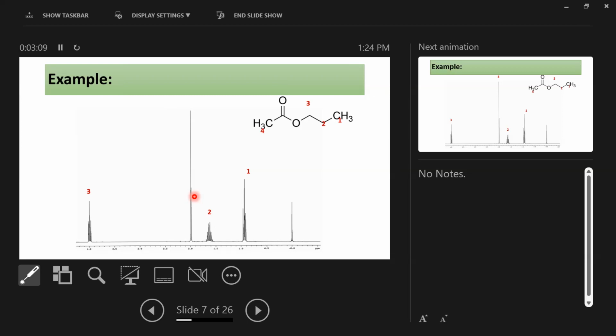How much time must I say it? All right, we'll say it again. Deshielded, downfield, closer to 12. Upfield, shielded, closer to 0. There should be no confusion.